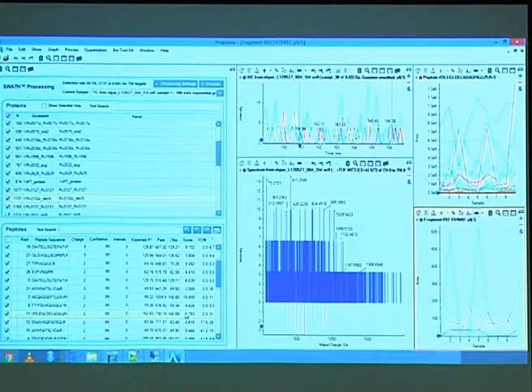Here. So here you have a peptide. You see the observed retention time is like 20 minutes before the actual end, so that's probably during the wash or just after the wash. It has an FDR of 0, but it looks like this.